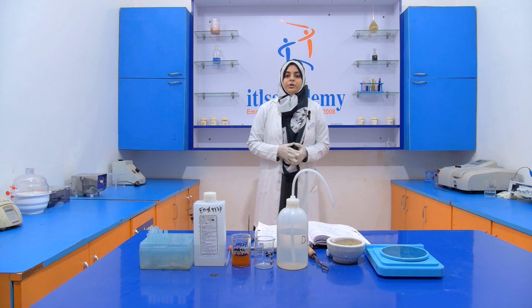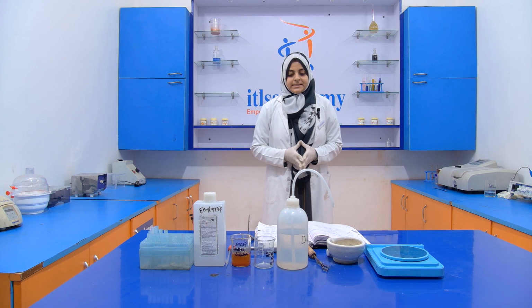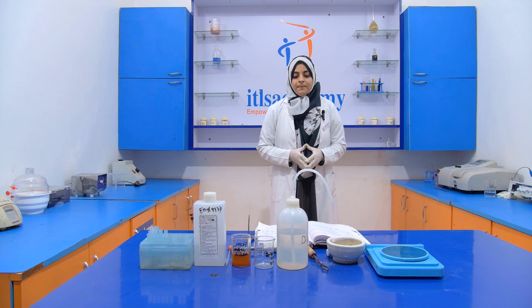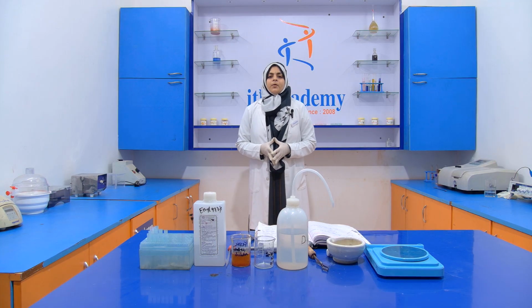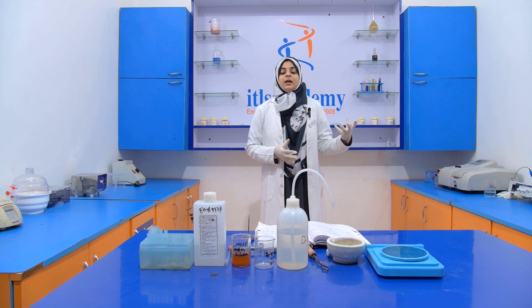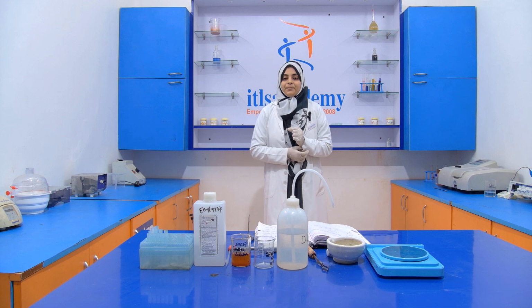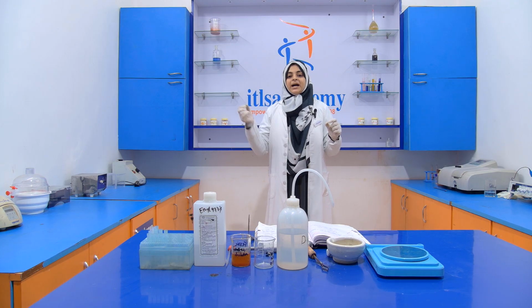Today we are going to perform another experiment in the adulteration series, that is the detection of papaya seed in black pepper. This adulteration is very common. What do the manufacturer or supplier do? They adulterate the black pepper with papaya seed because it looks very similar to black pepper.